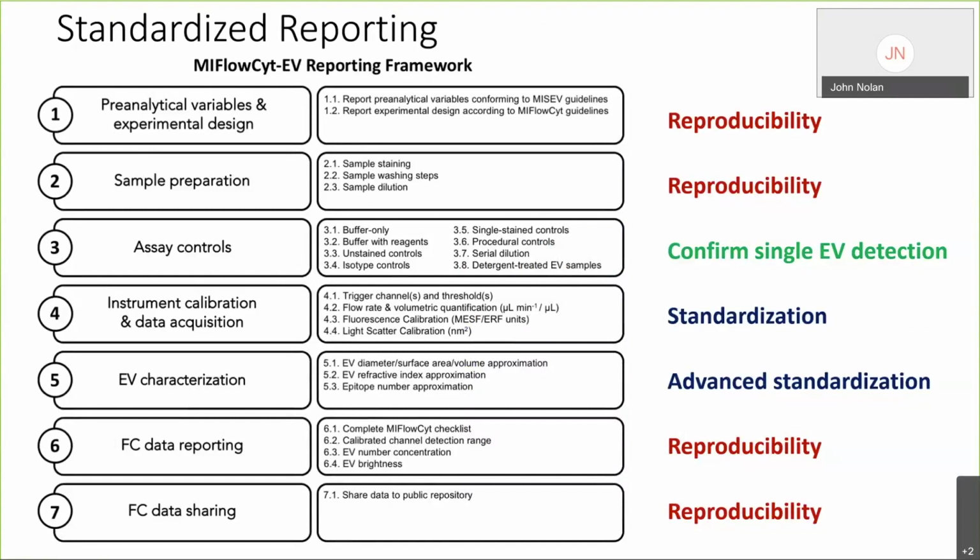I mentioned each of these categories, and the individual topics within them have all been designed or arrived at to address a specific artifact or challenge or problem in measuring EVs, measuring vesicles by flow cytometry. And being knowledgeable about the guidelines and adhering to them is going to increase the value of the work you publish.